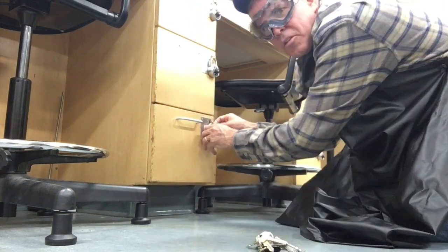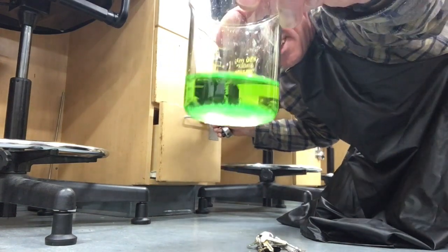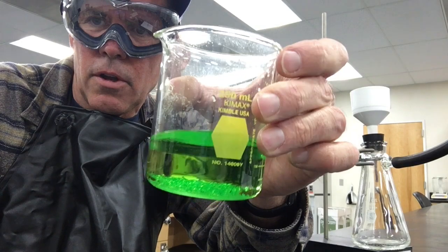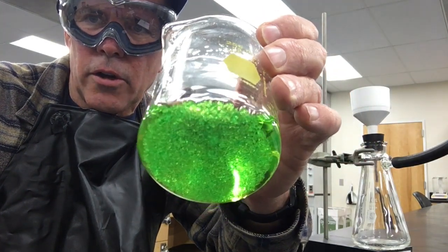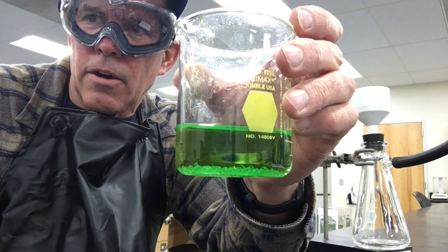I'm breaking into one of my student's lockers. Make very careful observations. Look at the supernatant. Look at the crystals. There's a very important observation right here.